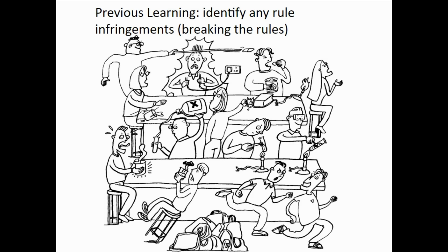You've got somebody who appears to be doing something correct, but I'm not sure if there's anything wrong with it there. He's got goggles on, he's heating a test tube in a safe manner, looks quite good. Opposite him, you've got 2 people running, 2 boys running.